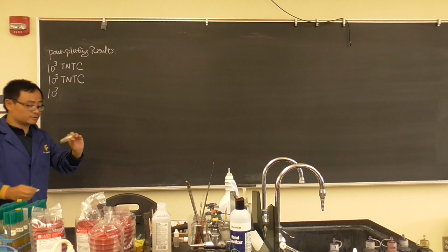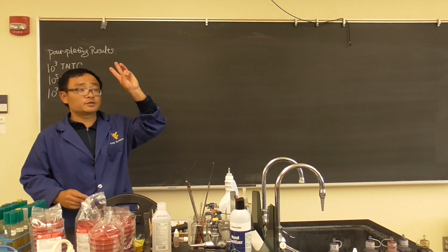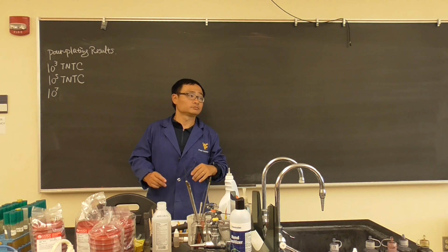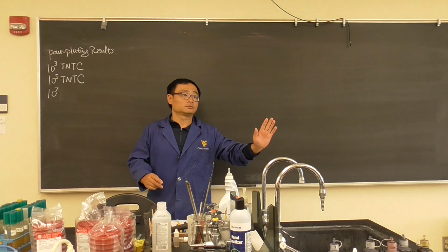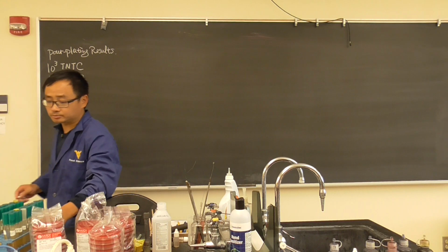10 to the 7th, absolutely you can count. So I want 3 numbers from the whole classroom. Can you count that? Count everything. Yeah, just give me 3 numbers from the whole classroom. I want a 10 to the 7, just tell me. If your plate is horrible, you don't have to do it. If it looks good, countable, you can do it.